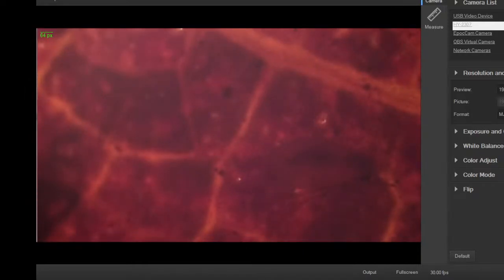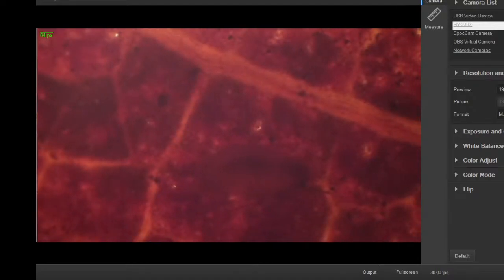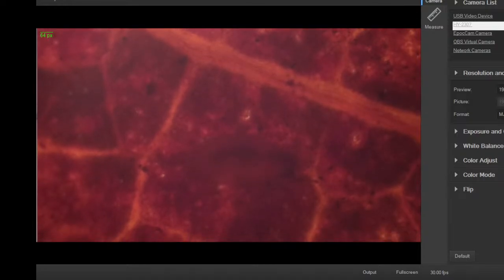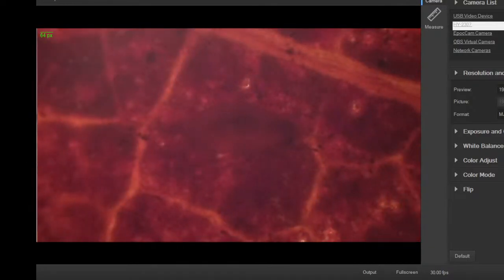Ooh, what is that? There is a dead critter. That might be a mite. That's cool. It's very dark on the camera. Very much a mite. So the legs are too short to be a spider. I'm gonna have to collect that if I can.